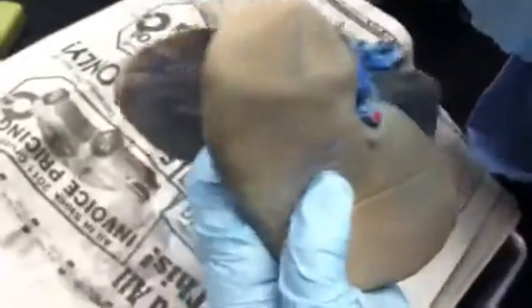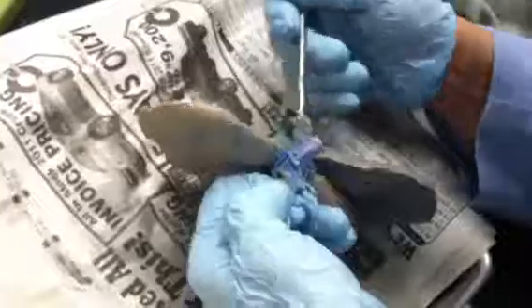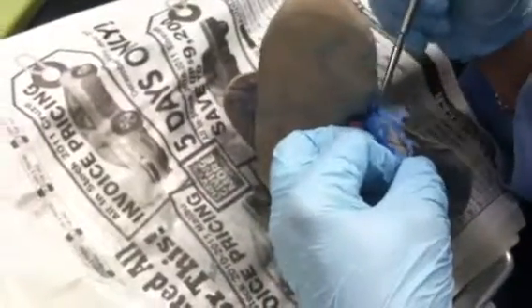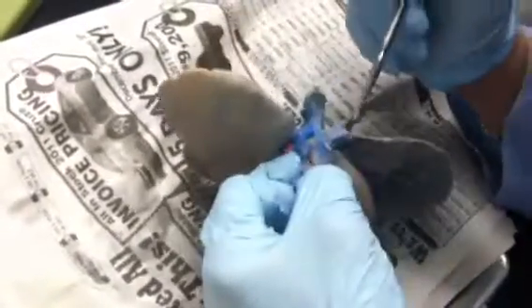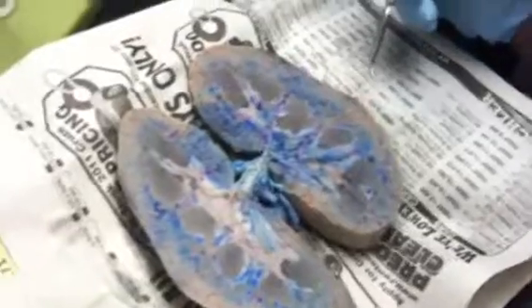The blood vessels are, well, there's an artery and a vein, but we're only seeing the artery here. There's an artery there, but there's another one here too. That's an artery. This is probably the vein, and this is probably the ureter, but it's too chopped up. This is probably the vein right there. Renal vein, renal artery, and ureter, which usually has fat around it, but it's really stretched out of shape. Radiate are up here. Those are supplying or taking away from the nephron. Okay. Supply and taken away from nephrons.